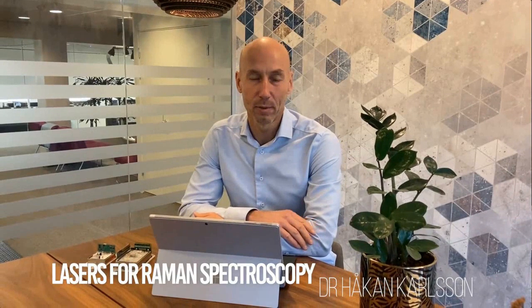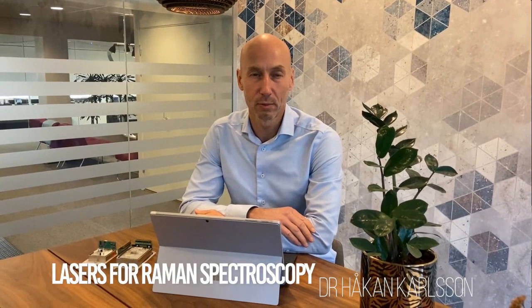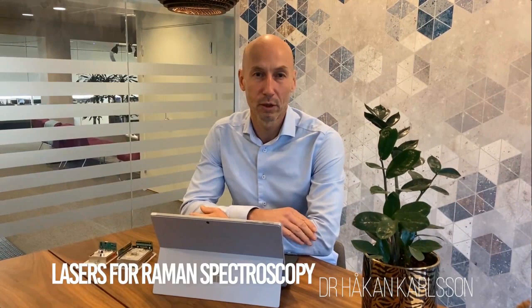Welcome to this webinar about lasers for Raman spectroscopy. We're going to talk about the most important performance parameters of a laser source when you're choosing a laser for a Raman spectroscopy experiment, why they are important for different types of Raman applications, how you achieve these laser performance parameters from different types of lasers, and finally how we here at Uniphotonics are characterizing our lasers on these parameters.